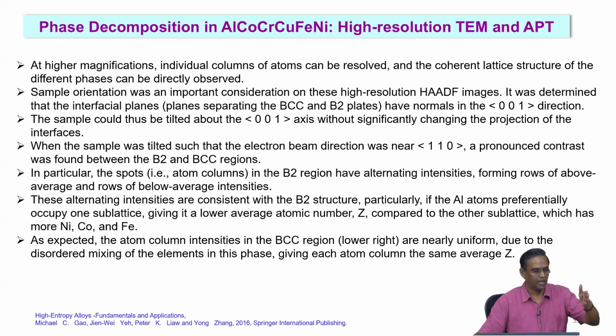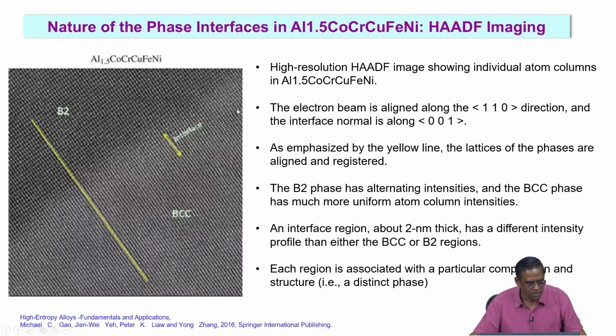So, I can look at these atomic columns, whichever is brighter, then I will be able to relate it with the corresponding atomic number. I can do that in these images. So, this is the image I was talking about. I think there is a mixing of the slides.